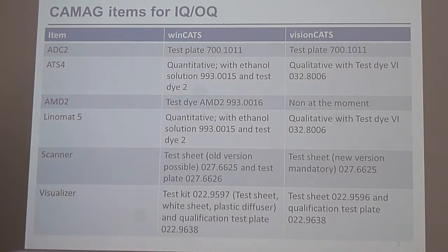Then you have the reproducibility, and that is what we really want to show at the qualification. If you measure 28 times the same, that is what we want to prove with the scanner. So we are waiting for that. But as you're right, I think in total we will earn more because they have more time.